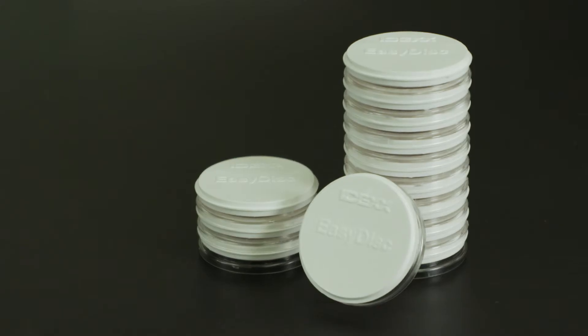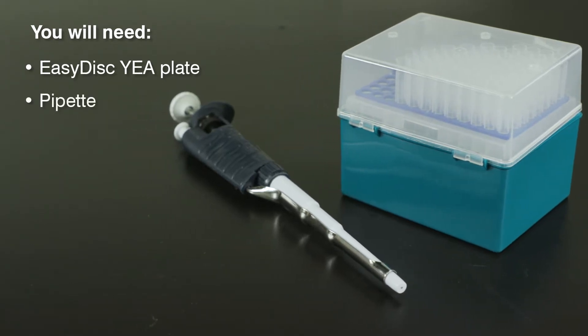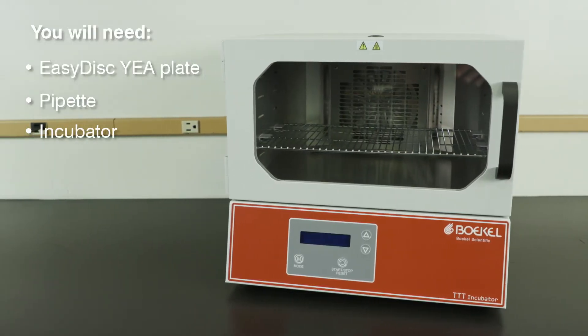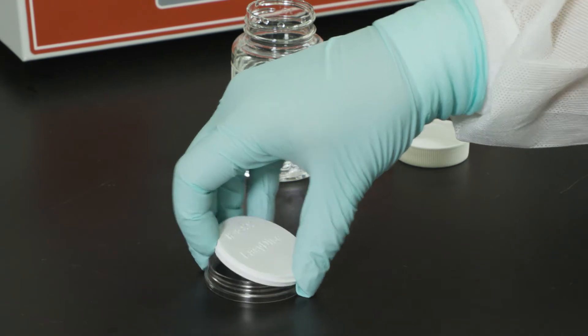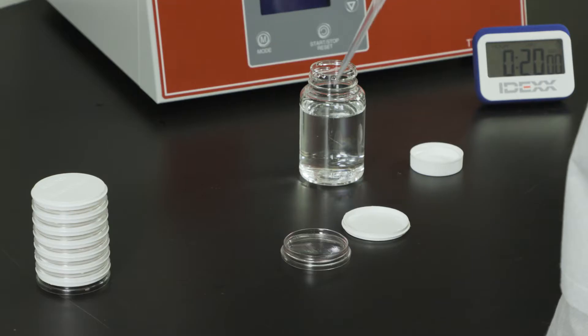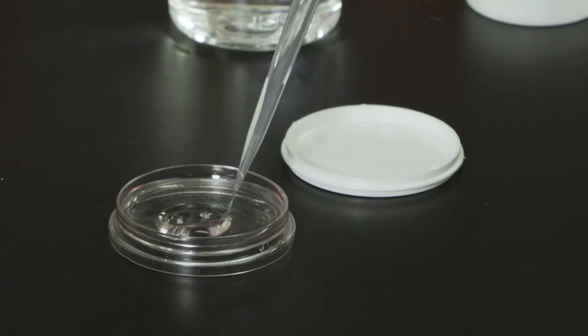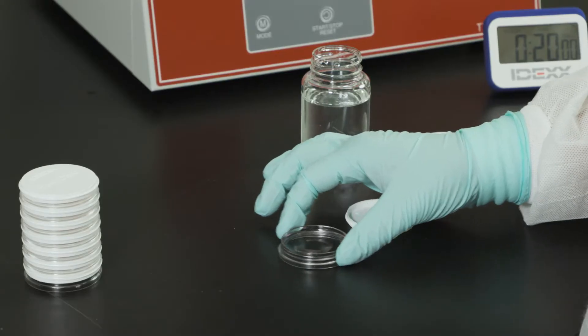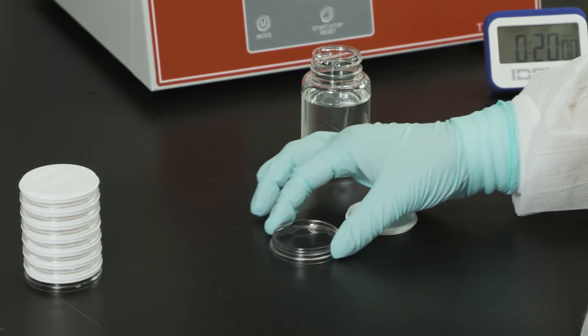For this demonstration, you will need an EZ-Disc YEA plate, a pipette, and a temperature-controlled incubator. Remove the lid and add 1 ml of water sample directly to the EZ-Disc YEA plate. Gently swirl to coat the entire plate and replace the lid.